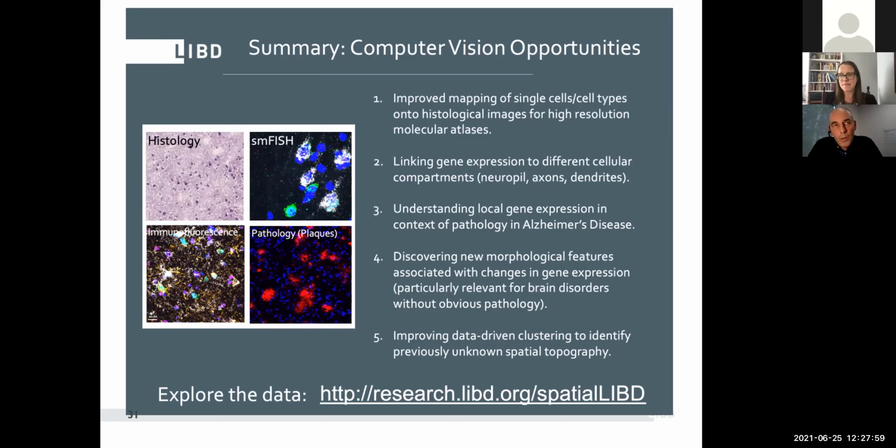So the first part of that is how do you deal with competing expression within one spot? How do you define a spot as being dominated by one cell type? And I guess the second part is what path do you see in going from that group average to a higher resolution analysis of individual gene expression?